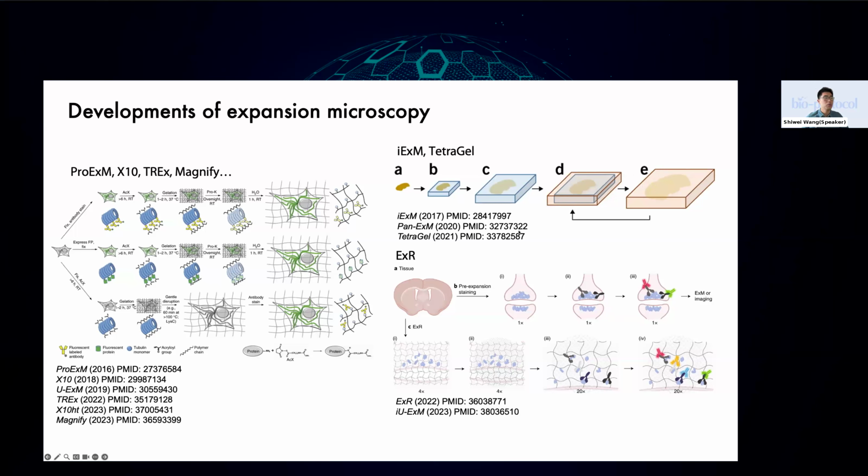resolution. And more recently, our lab published expansion revealing, where the improvement is that you no longer need to degrade the first gel, which solves a lot of the logistical problems and makes the protocol simpler, where you can expand 4-fold and expand again to reach around 20-fold expansion and therefore 20 nanometer resolution.